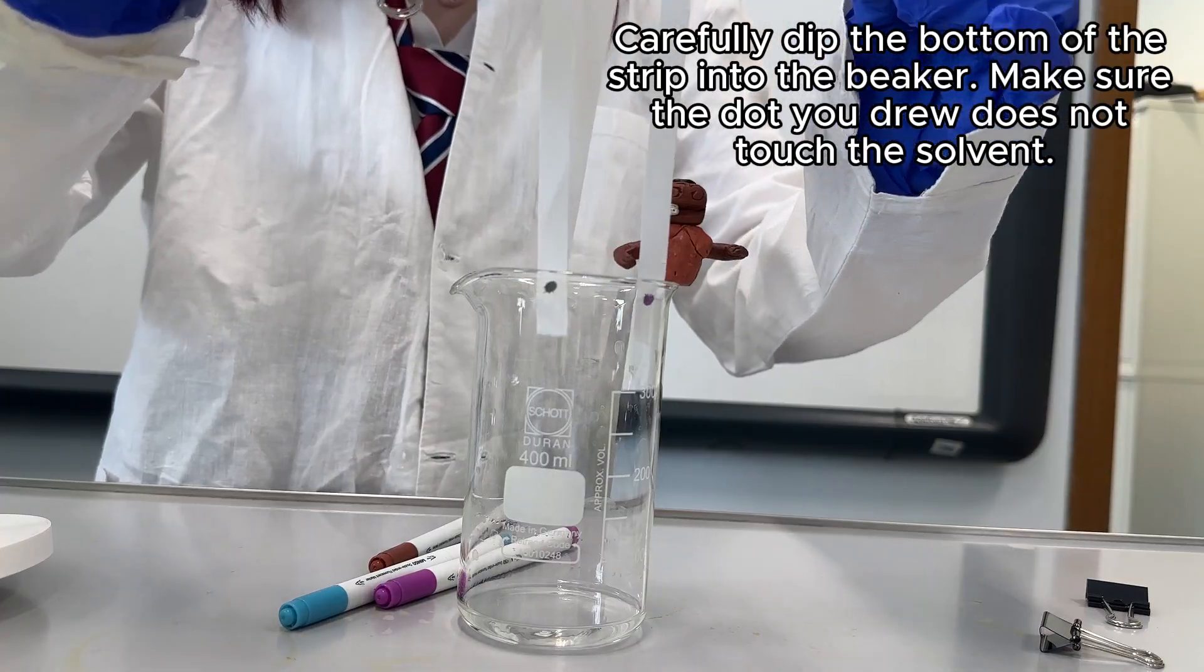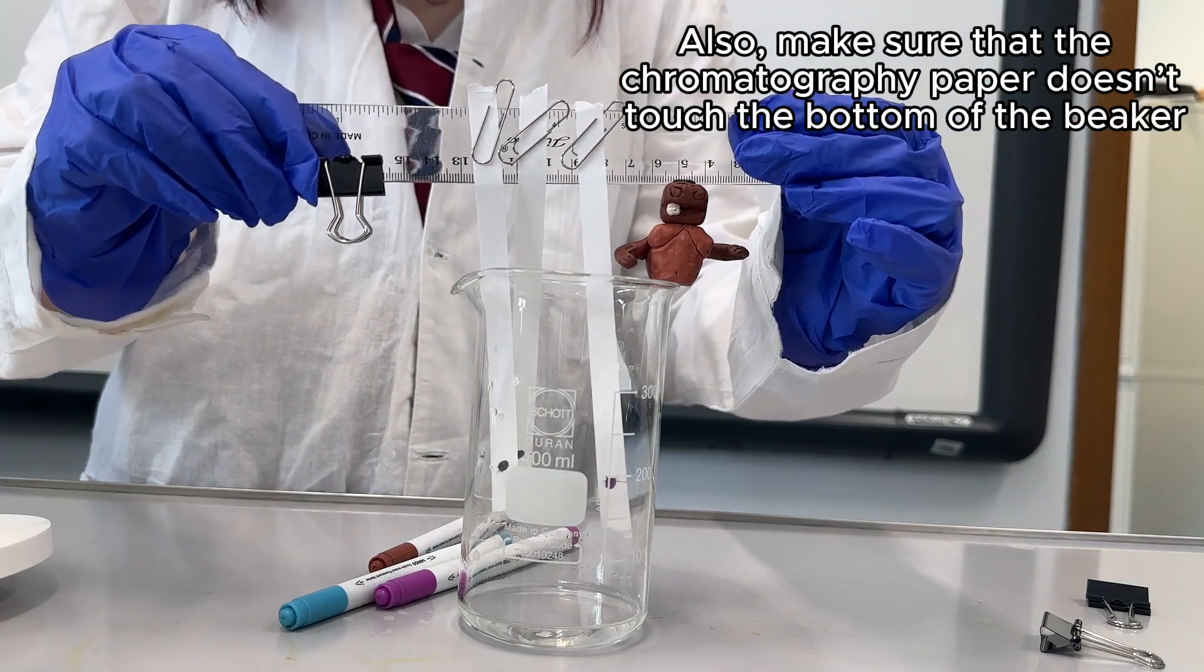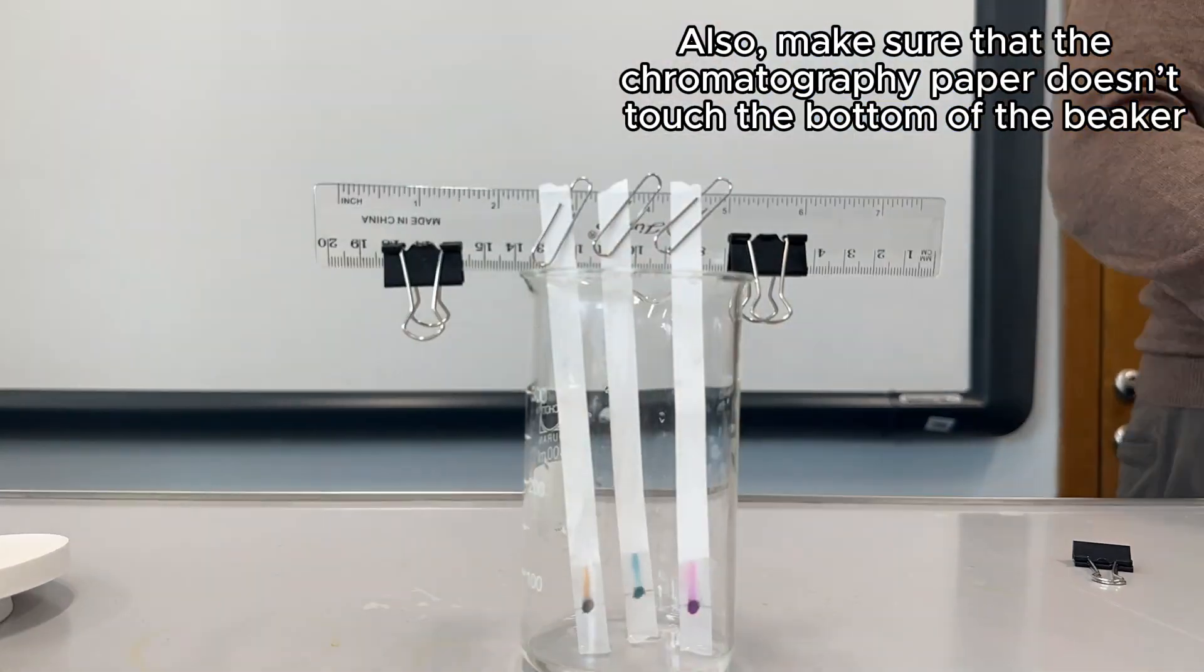Carefully dip the bottom of the strip into the beaker. Make sure the dot you drew does not touch the solvent. Also, make sure that the chromatography paper doesn't touch the bottom of the beaker.